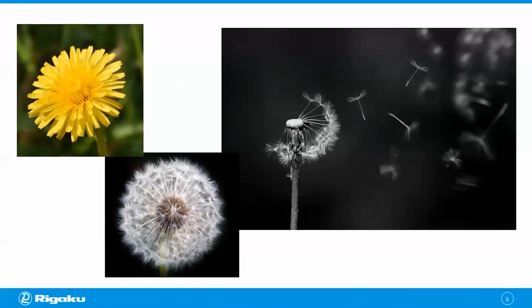And for those life cycles, we could, for example, image the flowers. We could examine a seed head. We could also image the delicate seeds themselves. Regardless of the parts we choose, we will find that our experiment can be compromised because these samples can and will move during our experiment.